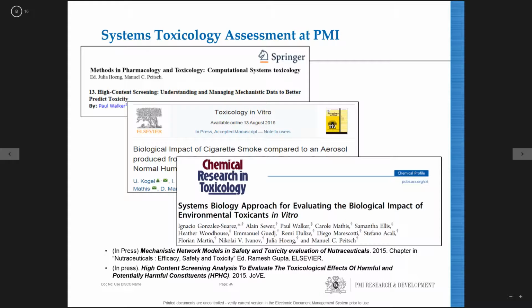In the case of high content screening, we haven't done that yet, but we're currently working with Barry Thomas and their team to try to come up with some challenges or some ideas of how to verify, ensure, or improve the quality of these processes of high content screening data. But that brings me to another point, that even if you want to do that and you want to share your data, there are some challenges on how you do that.